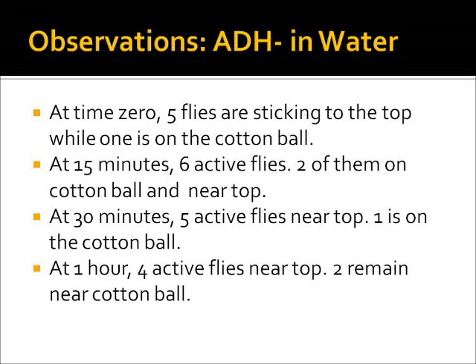Observations for ADH minus in water. At time 0, 5 flies are sticking onto the top, while one is on the cotton ball. At 15 minutes, 6 flies were active, 2 of them on the cotton ball and near the top. At 30 minutes, 5 active flies were near the top, and 1 was on the cotton ball. At 1 hour, 4 active flies were near the top, and 2 remained near the cotton ball. At the 24-hour period, 1 fly had died. The rest, 5 flies, were active.